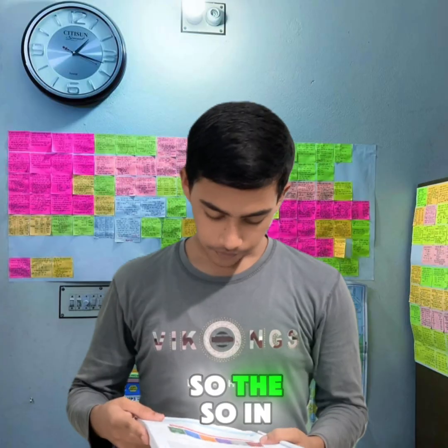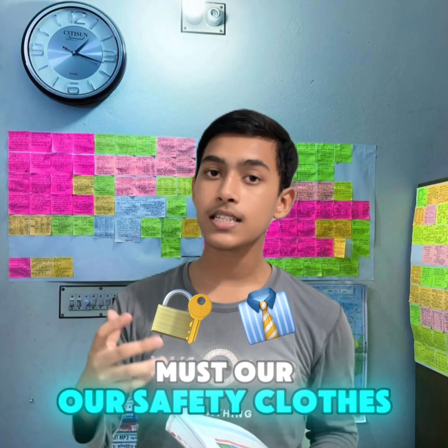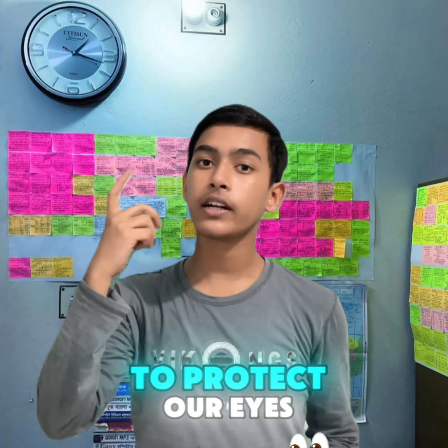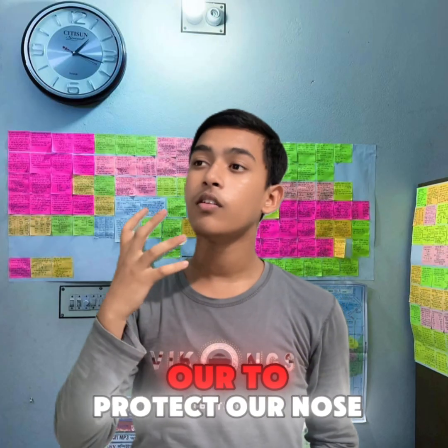So in the chemical laboratory we must wear safety clothes or aprons to protect our body, glasses to protect our eyes, and a mask to protect our nose and inner body.